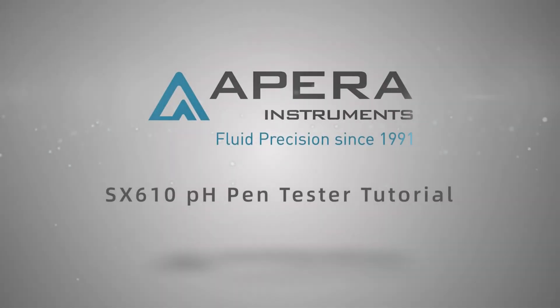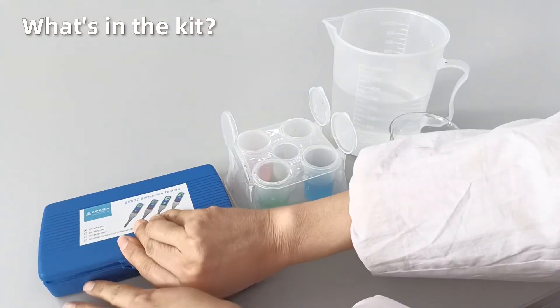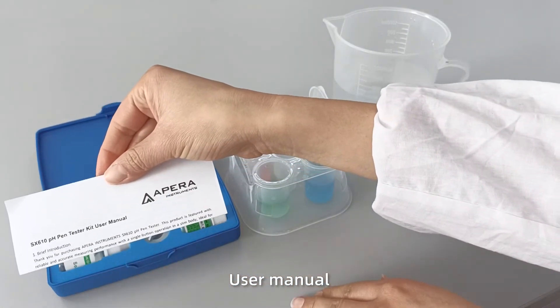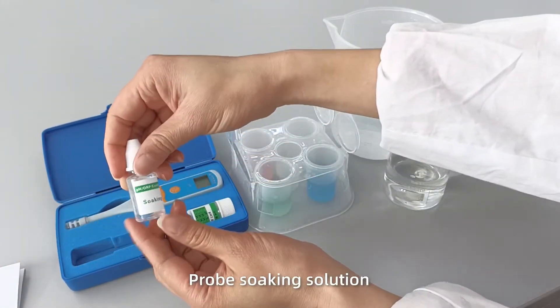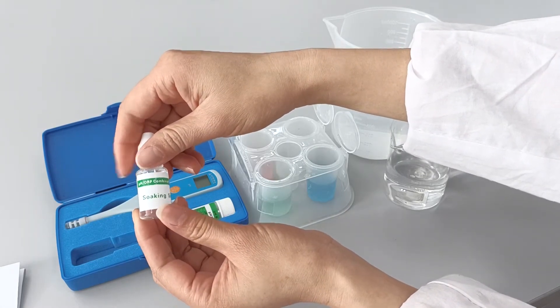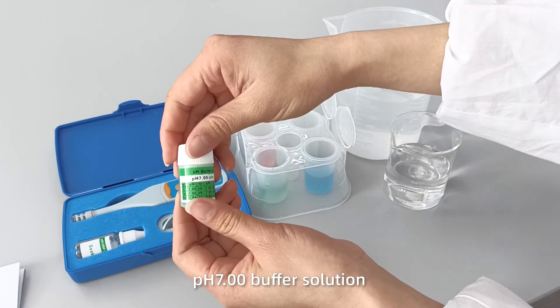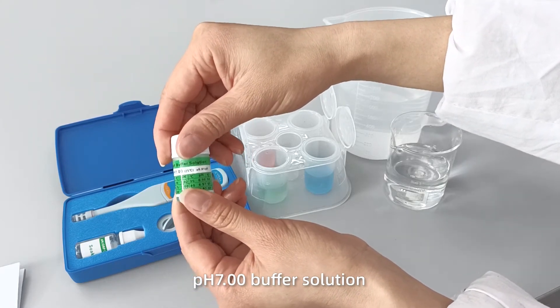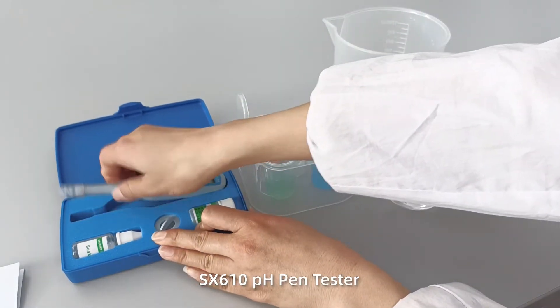Apera Instruments SX610 PH Pen Tester Tutorial. What's in the kit? User Manual, Probe Soaking Solution, PH7.00 Buffer Solution, and the SX610 PH Pen Tester.